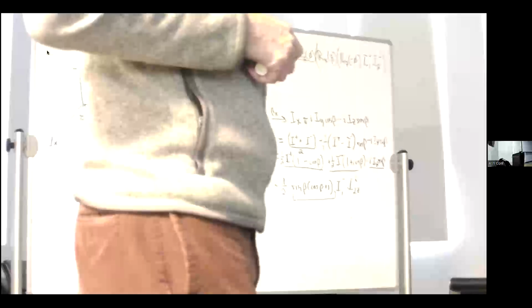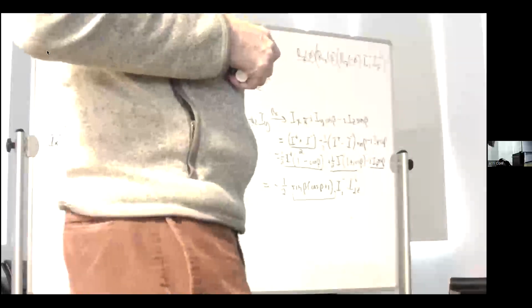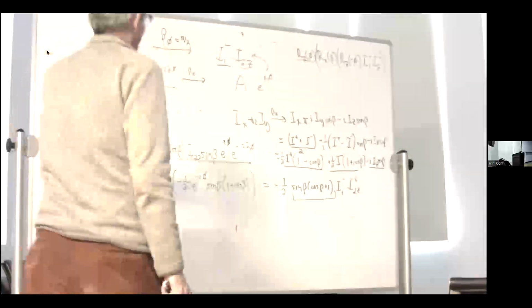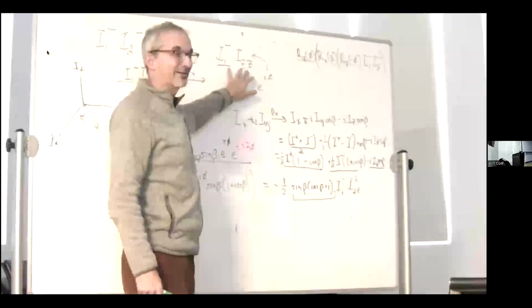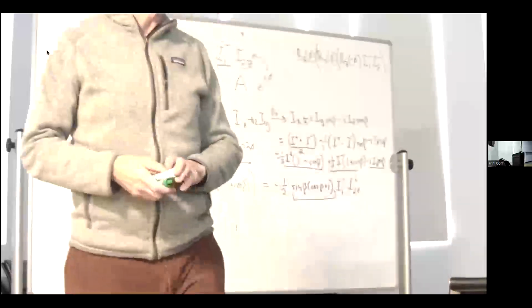Some of them maybe I phase cycle out. I change from Y to minus Y, see what happens to some things, then subtract out. But it could be that when I maximize beta, I end up with some other operator that's large that is going to be an artifact in the spectrum. So in some cases, my goal would be not to maximize this operator, but to minimize some other operator that I can't otherwise get rid of.